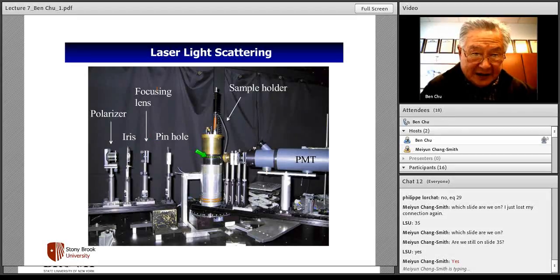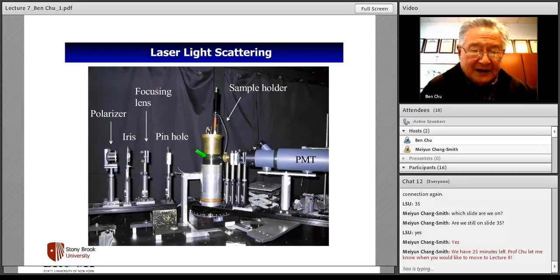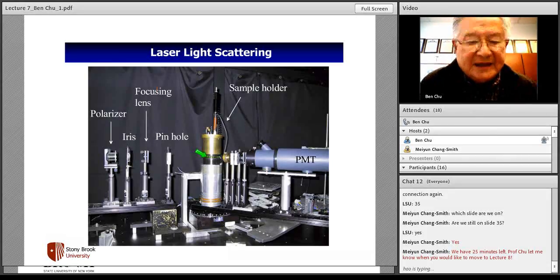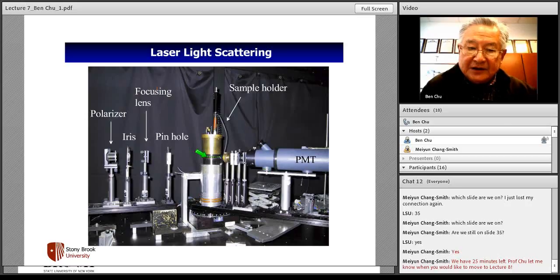As you can see, underneath the sample there's a thermostat. It's a little more complicated here because you want the whole system to be at a relatively constant temperature, but your sample may be heated to a high temperature or cooled down to a low temperature. Condensation will come in, and you want to isolate your sample from the instrumentation. So these provide a kind of thermal isolation.